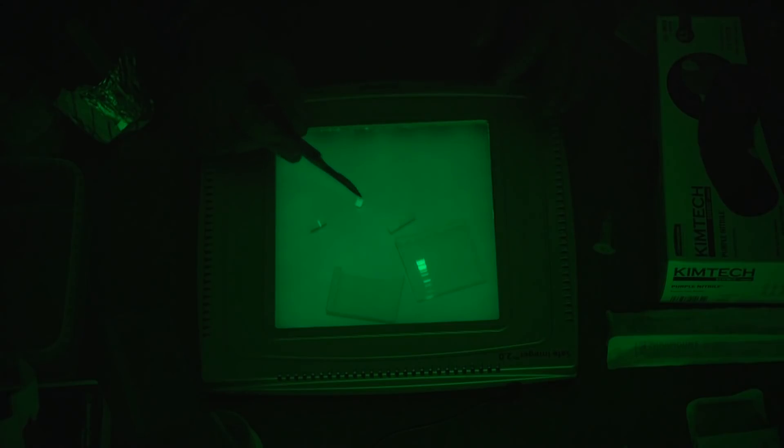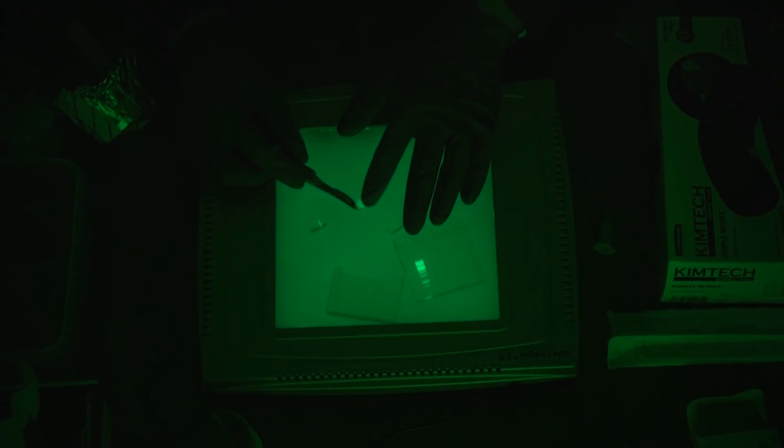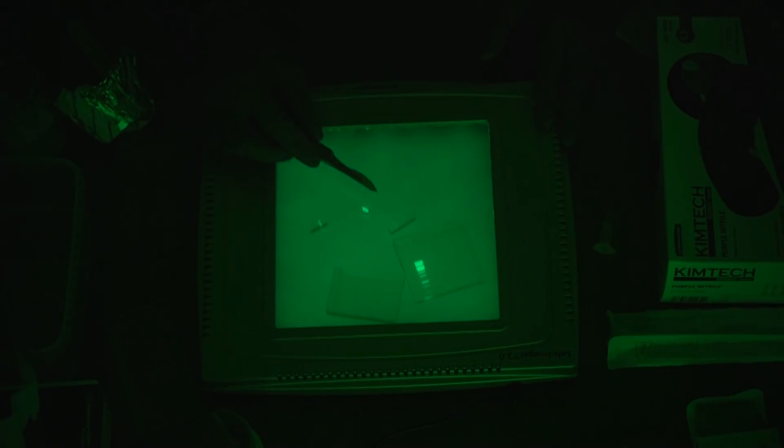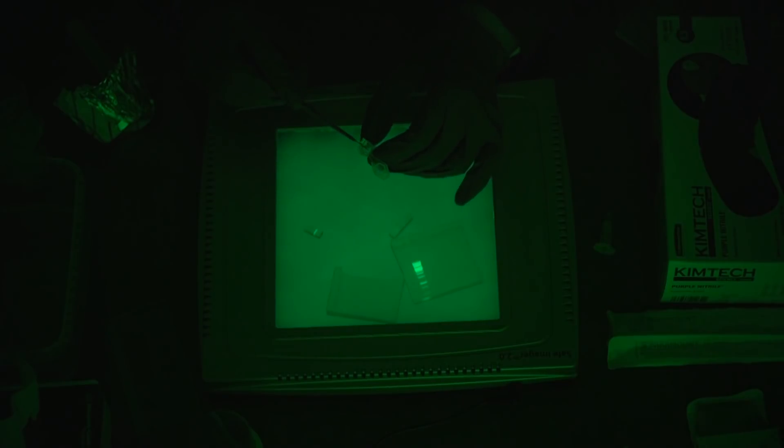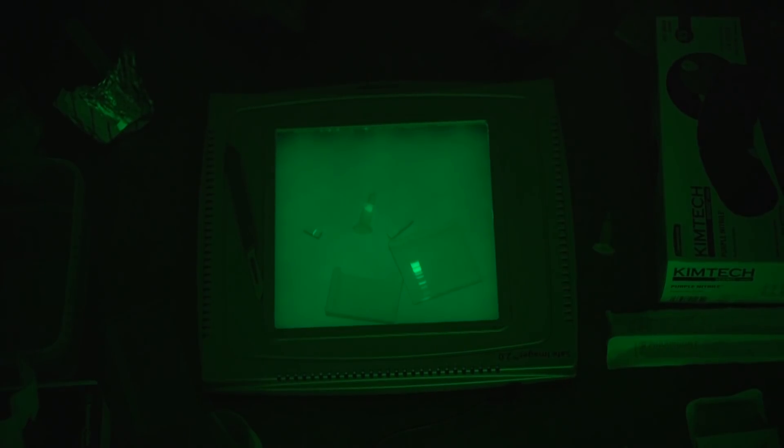And there you have it. This is about a 100 milligram slice of gel — thick enough to contain all of the DNA in our band, but not too thick, which means it will be easy to purify this agarose and separate it from our DNA later on in the protocol. Now I take a 1.5 ml Eppendorf tube, very carefully scoop up my band of DNA with the scalpel, and drop it into the tube. A perfectly isolated band of DNA cut from an agarose gel and ready for downstream purification and use in the application of your choice.